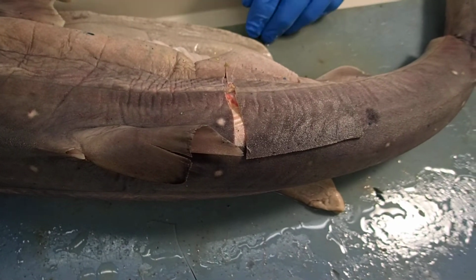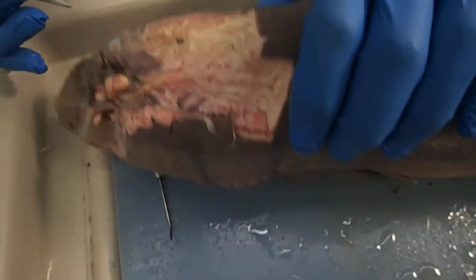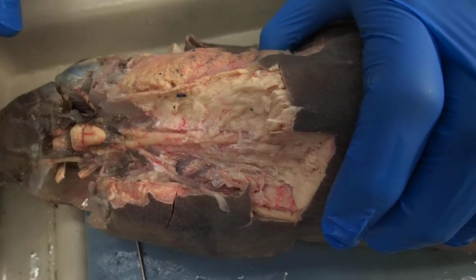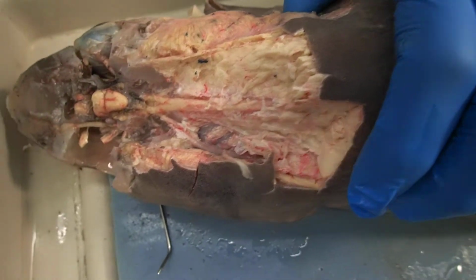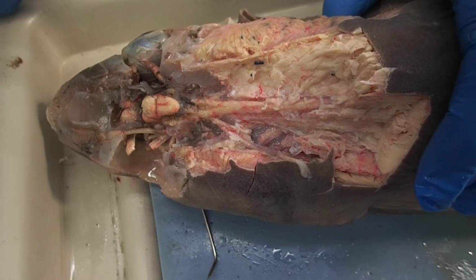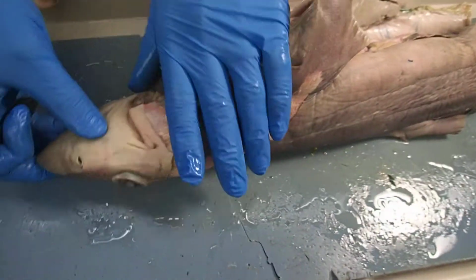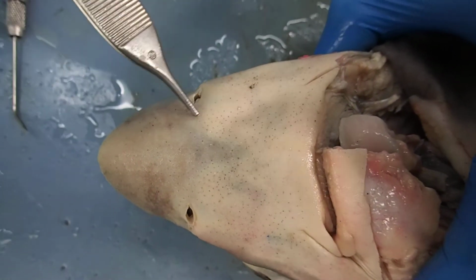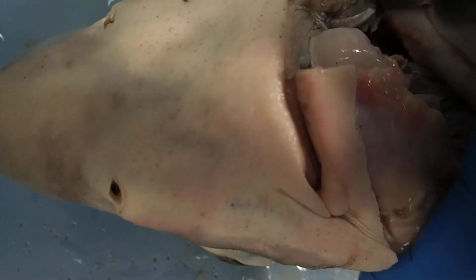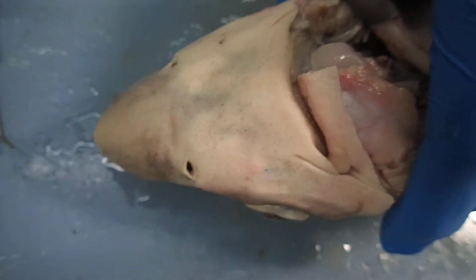All right. This lateral line canal will run all the way up and will go up along the head as well. So when we first skinned the shark, there's going to be canals running in a whole bunch of different directions up here. That lateral line system becomes more complex. That lateral line system also runs on the ventral side of the rostrum. All of those black dots that are along the rostral portion or the ventral portion of the rostrum are connecting to that lateral line system.